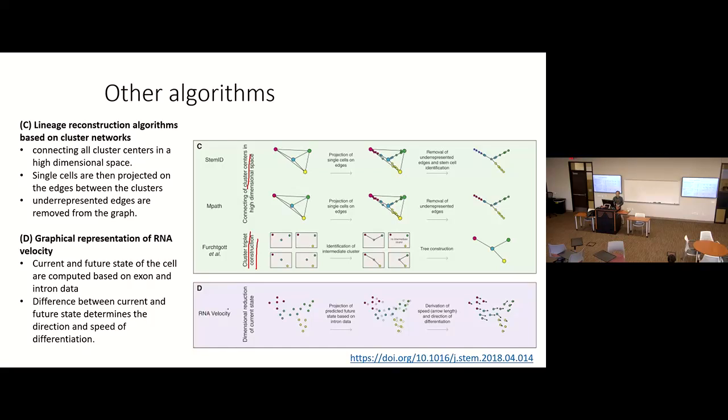I also want to mention RNA velocity. I don't know if you have heard about this. This uses information from spliced and unspliced mRNA counts. In this RNA velocity method, we build 2 matrices. This is a little bit different from building a trajectory, because it uses different information. So I want to mention this.